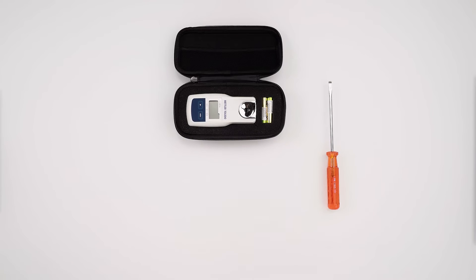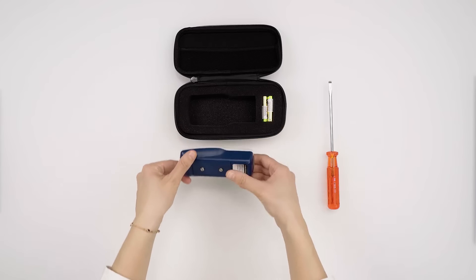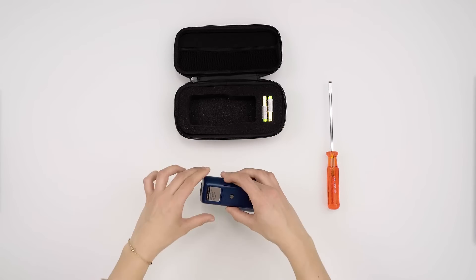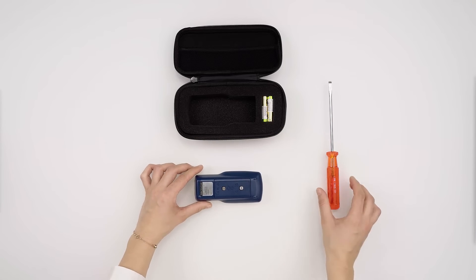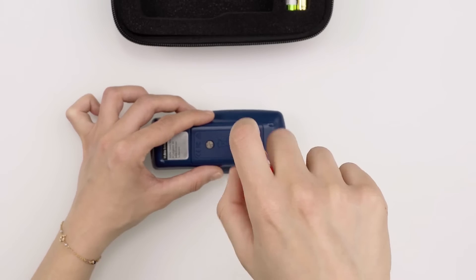Your MyBricks will be delivered in its black soft case. Remove the MyBricks from the soft case and turn it upside down. Remove the battery compartment cover with a screwdriver by turning the retaining screws in an anti-clockwise direction.